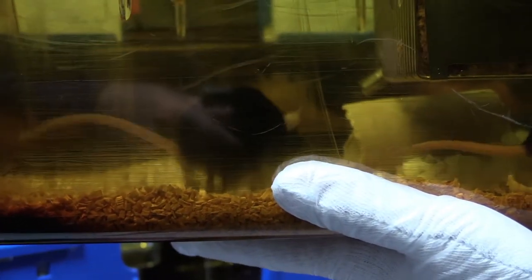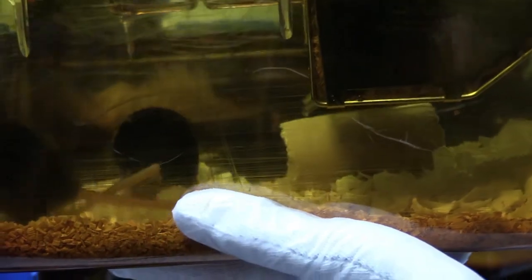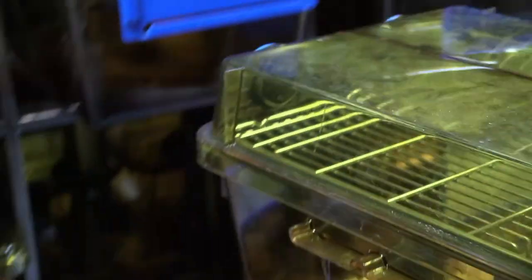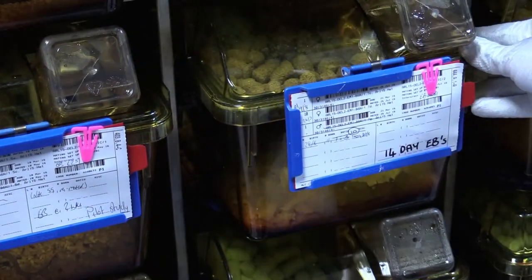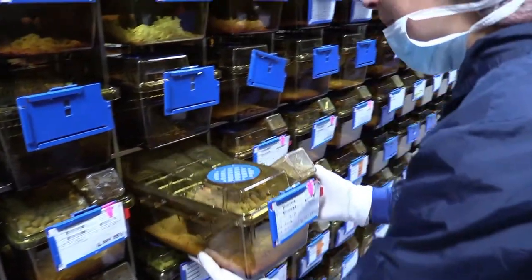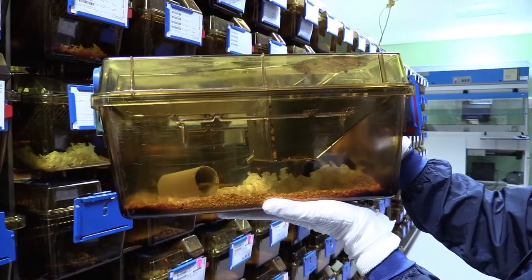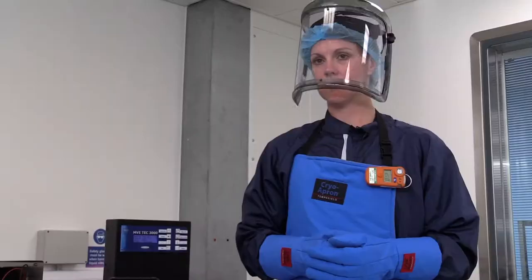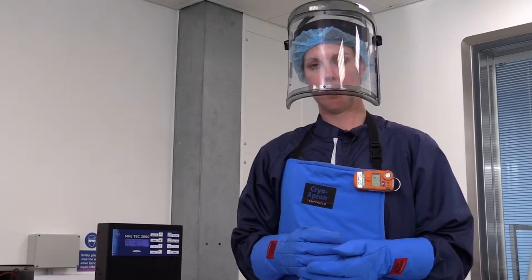It's also a lot cheaper to keep the samples in these tanks — it's a few pence a day to keep them stored in liquid nitrogen, rather than many pounds per day or week to cover the cost of changing bedding and diet, and people coming in to check the mice every day.